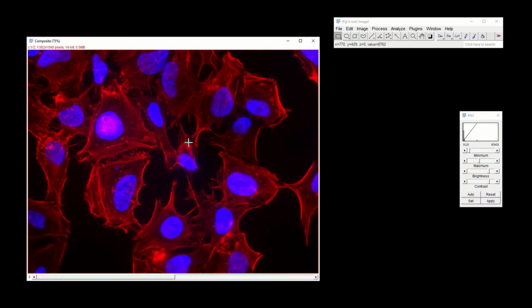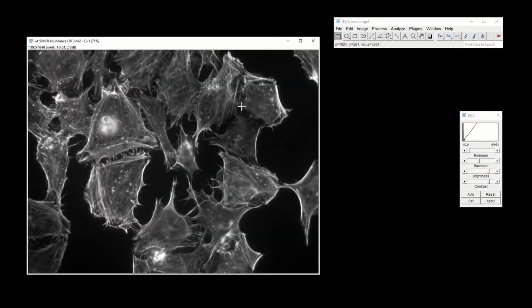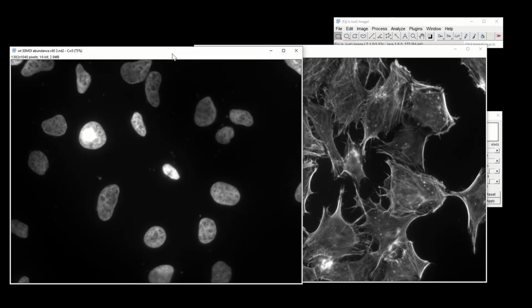So right away you can see that this is a pretty picture, but if you look at the bacterial cells right over here, it's very difficult to see them. They're still not bright enough. So I suggest we go back and continue enhancing our images. Let me close this for a sec and reopen this file. That's kind of the unfortunate thing with ImageJ. You have to reopen the file all the time, or alternatively, you could duplicate your images. You duplicate them by clicking, I believe it's Control Shift D, or just Control D. You can check whether this works for you.